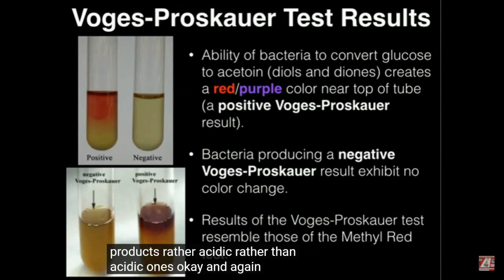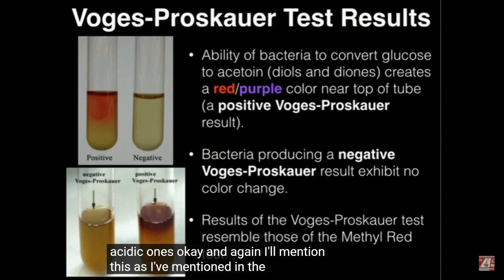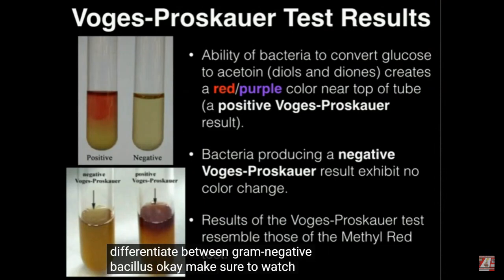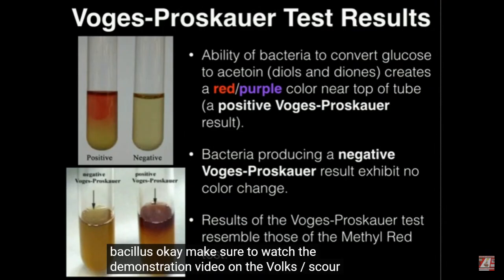Okay? And again, I'll mention this, as I've mentioned in the previous videos, this is another one of the techniques that we're going to use to differentiate between gram-negative bacillus. Okay? Make sure to watch the demonstration video on the Voges-Proskauer test.